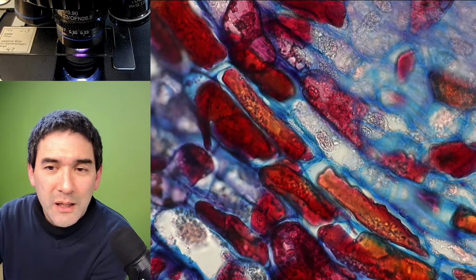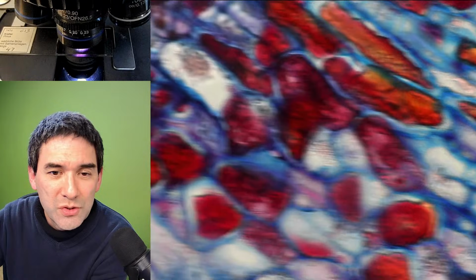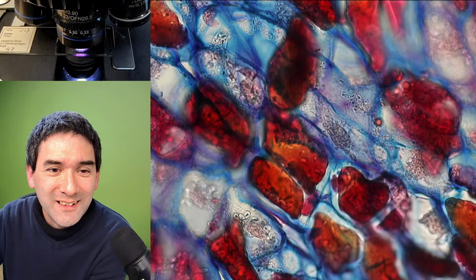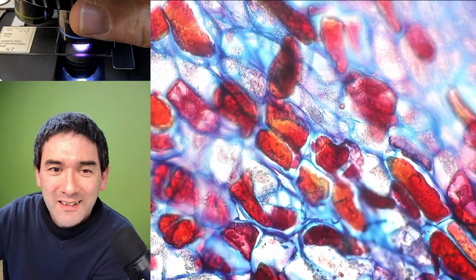Okay, what I'm going to slowly do, it's been now again approximately 1.5 hours. I too start to feel a little bit tired right now, talking, and yeah, anything microscopy is interesting. Yeah.